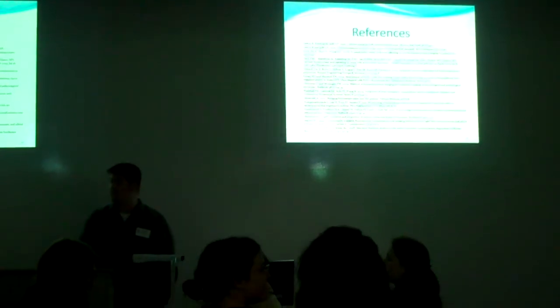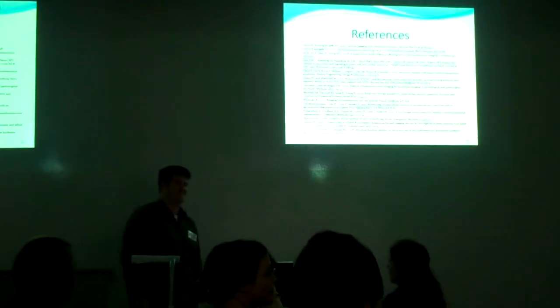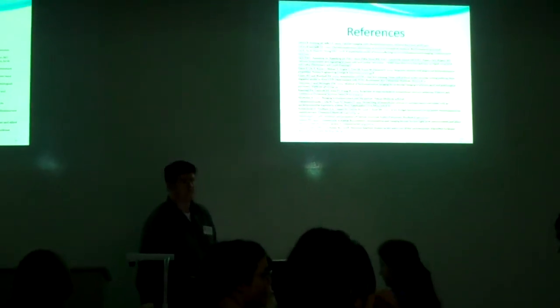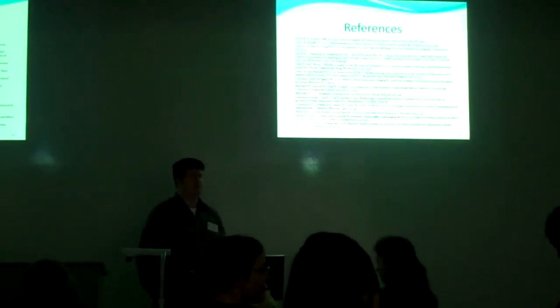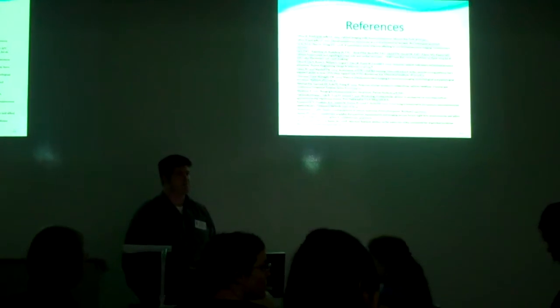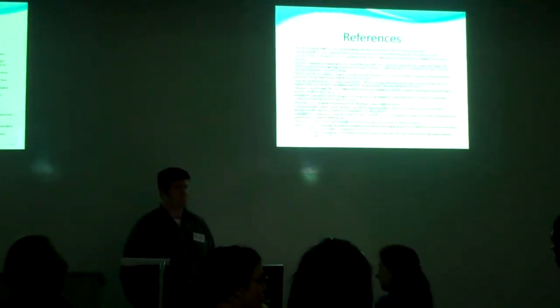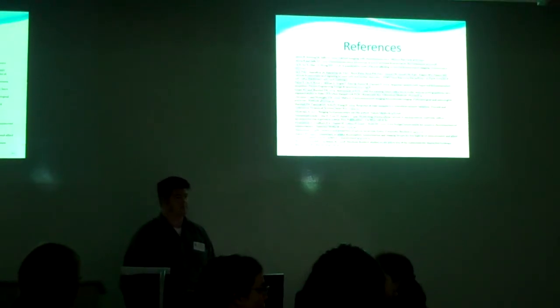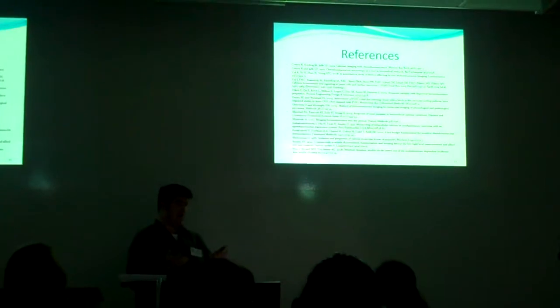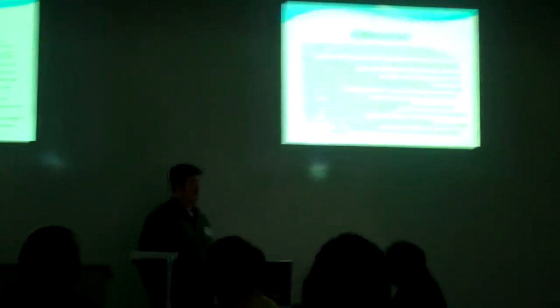We have time for one or two questions. Jordan, I have a question. I've purchased in an equipping lab both charge couple device instruments and PMT photomultiplier tube instruments. And the latter are often much more expensive, but much more sensitive. How does your home-built PMT-based system perform compared to the commercially available CCD-based systems? You want me to compare and contrast the CCD versus the PMT? Performance-wise, yes.